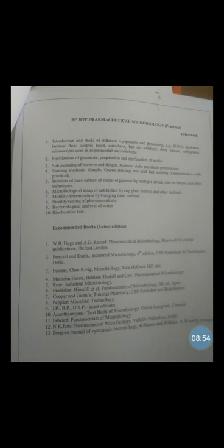So what is the observation result? The colonies appearing in Petri plate A are not distinct, small and overlap with one another. Then in Petri plate B, the colonies are large, discrete and generally do not mix with other colonies. And in Petri plate C, the colonies are larger and isolated colonies with distinct shape, color, texture, size and form are observed.